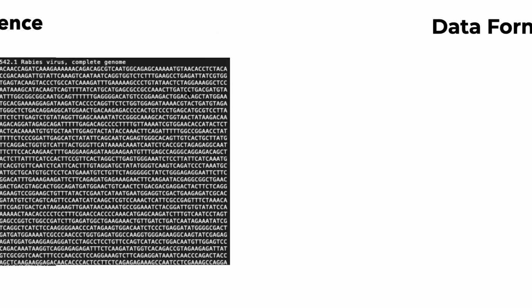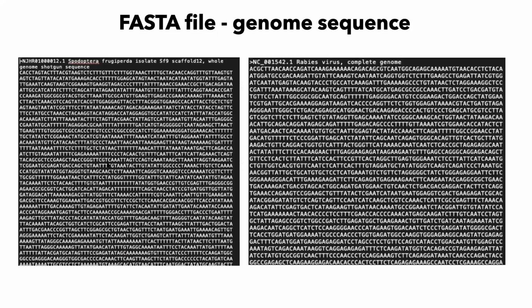Here's an example of a FASTA file. You already know what a FASTA file looks like. Okay, so the FASTA files contain continuous sequences that are not broken up. If they are from a big, large organism like a human, they will be broken up into chromosomes. If the data is not assembled in a single genome, those will be called contigs. Okay, they're assembled in bigger chunks, but not the full genome, and those are called contigs.